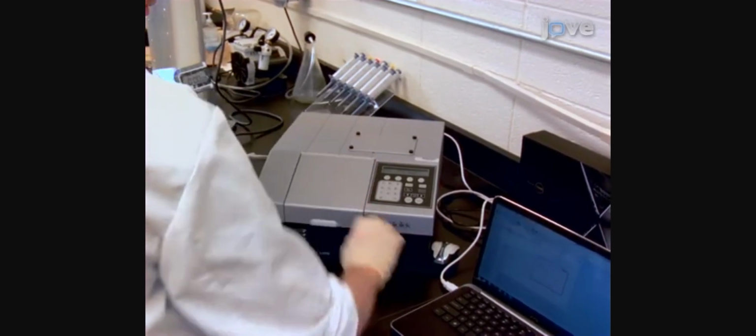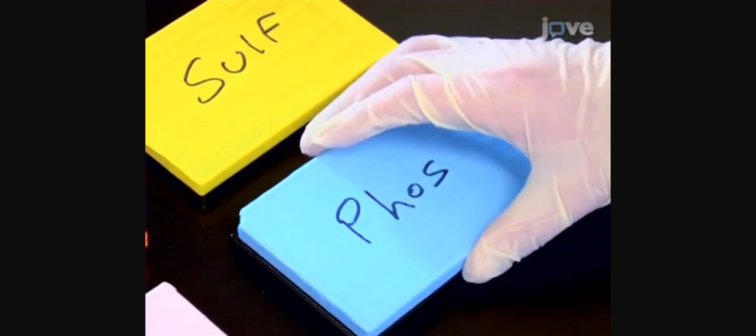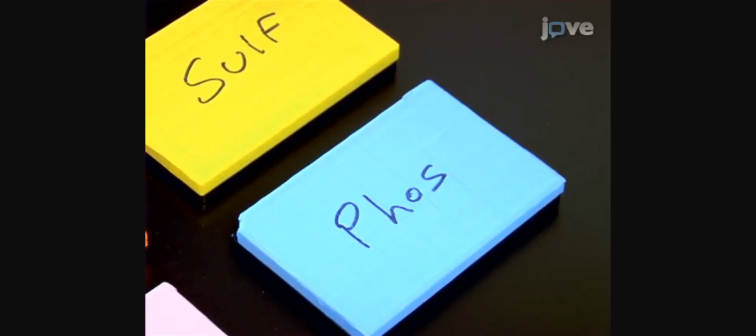After reading fluorescence, incubate the microplate at room temperature, either in the dark or covered with an opaque lid to reduce light degradation of MUB. The incubation time required to measure maximum potential enzyme activity will depend on the enzyme concentration within a sample. Since this is unknown before the sample is assayed, a microplate will have to be read at multiple time steps. For most enzymes, 10 to 15 minute intervals over the course of an hour is appropriate, although some samples with high concentrations will peak before 10 minutes.